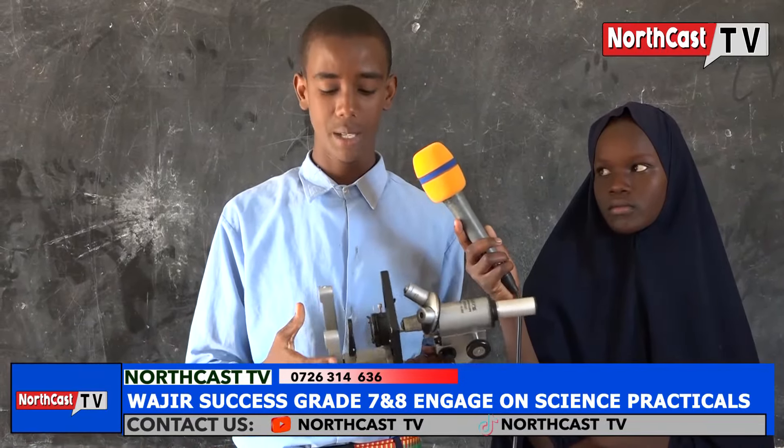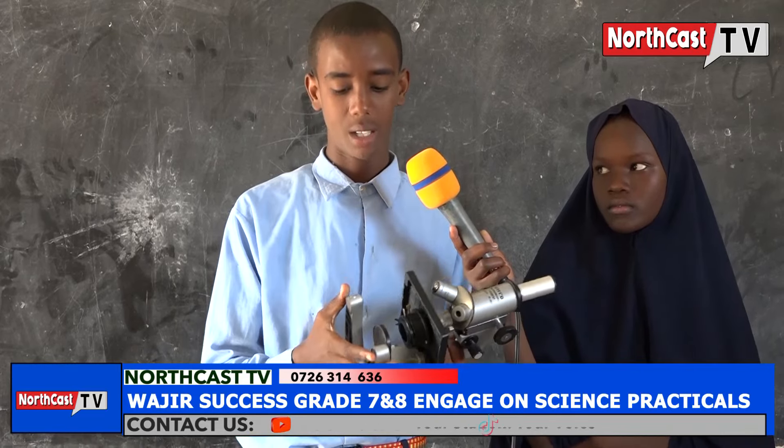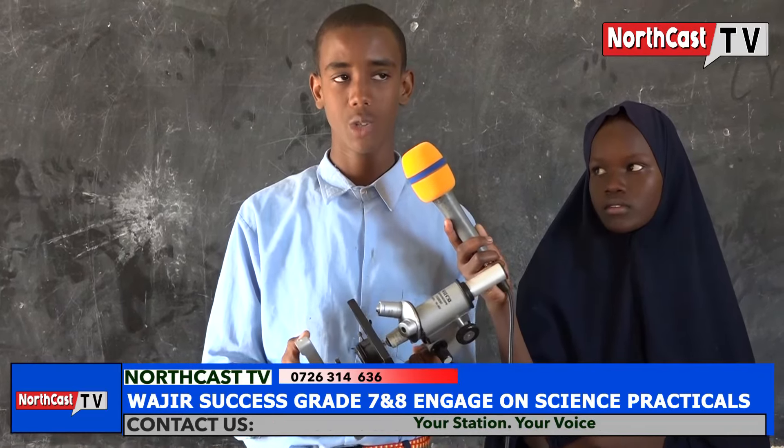We're going to start with the base. This is the base. It provides firm support which makes the microscope stable on the bench.